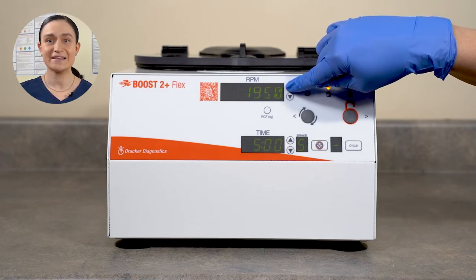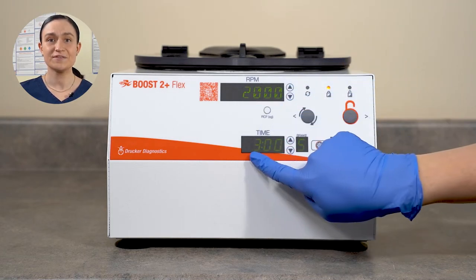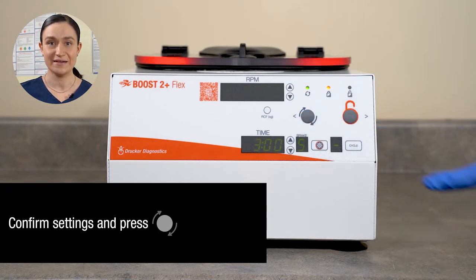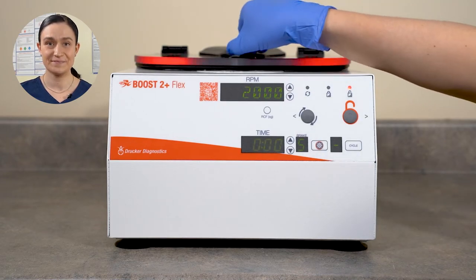For a more detailed guide, click the video on your screen. In our case, we're going to run at 2,000 RPM for 3 minutes. Once our settings are displayed as desired, we check that our lid is closed and latched, then press the Start button. The centrifuge will start spinning. Once it reaches the programmed RPM, the timer will start counting down. Once it has run the full time, the centrifuge will begin to slow down, applying the brake as set. Once it has come to a complete stop, the lid lights will flash and the centrifuge will beep to let you know it's done. And that's all there is to it — you just ran your first cycle.